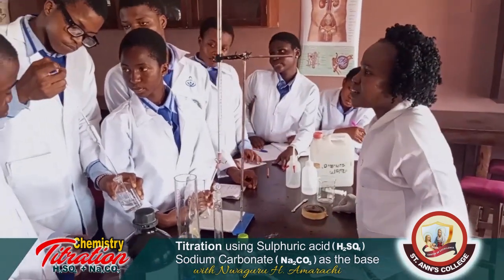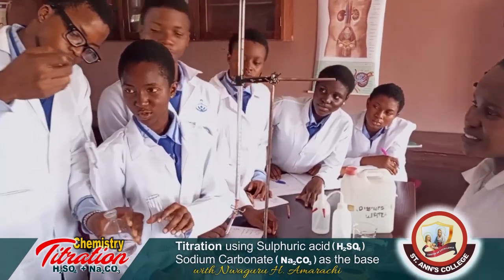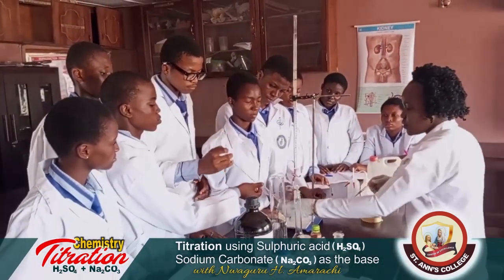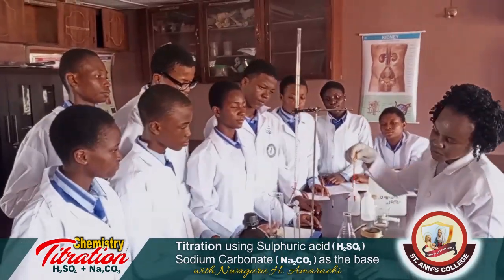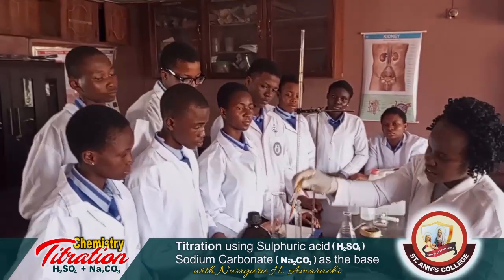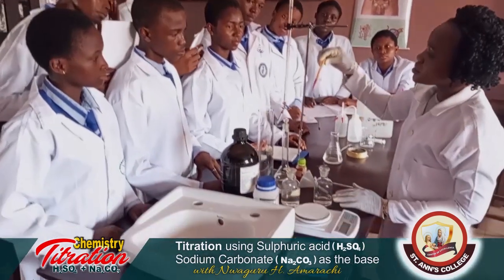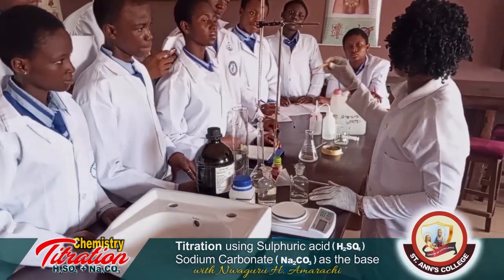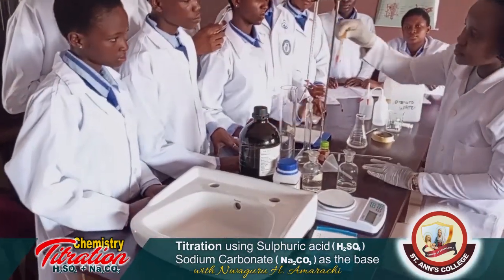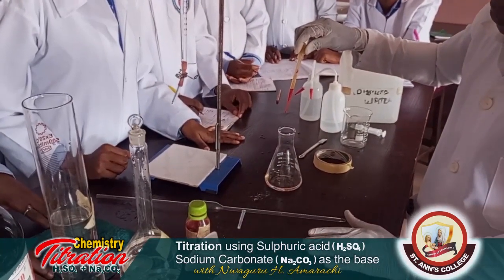Gradually, easy, good. Then our indicator, 2 drops. You may see me doing this: I'm trying to remove some bubbles from the dropper, because if there are bubbles, it will not give you the exact drop you are looking for. So you have to remove the bubbles and have a clear view of your drops. 1, 2.